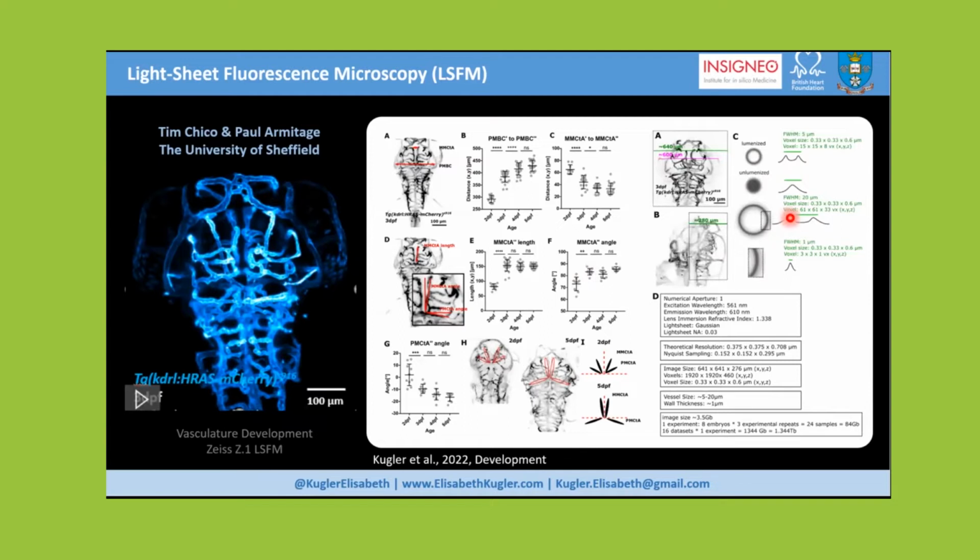All of this, like I said, informs us on the field of view, the region of interest, and the resolution. But this is really just to highlight that at the start, I always spend a lot of time trying to find out what the data properties are, what we need to improve, and how all of this leads into data quantification later on.